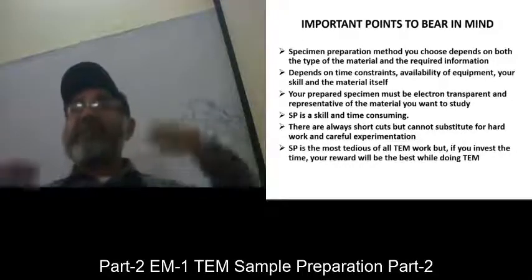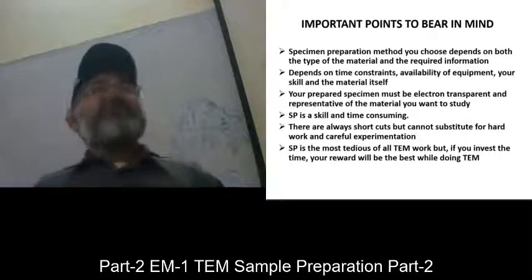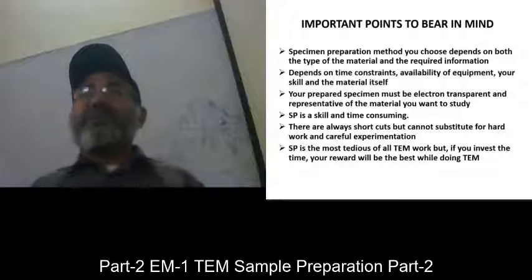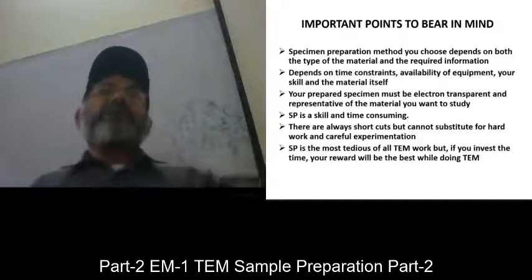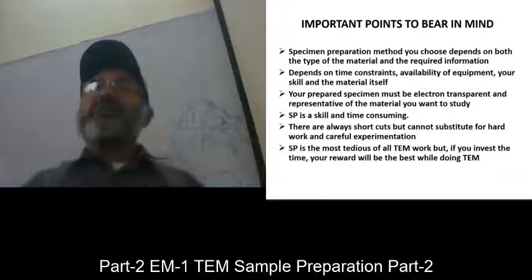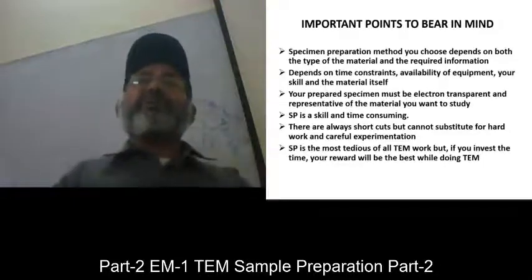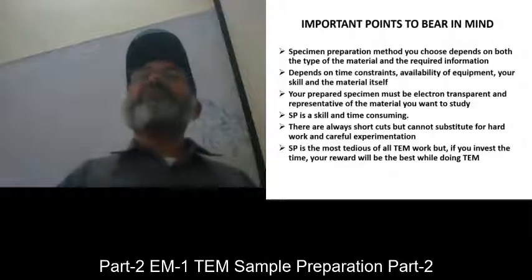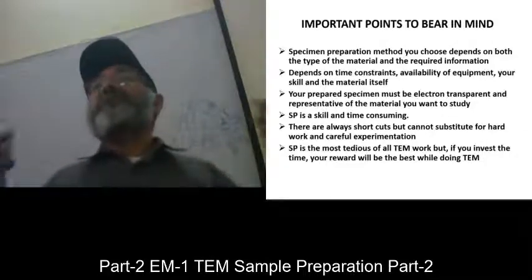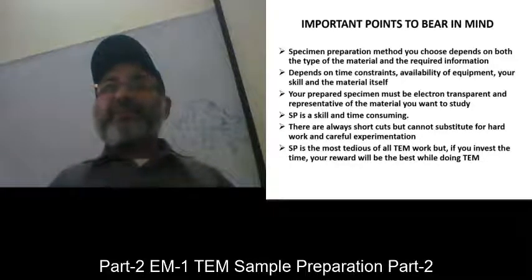Now, when smartness came, people got more experience. They have slots on the booking sheets for 2 hours. So you book 3 consecutive sessions, and you can use the machine for 6 hours. But if your sample needs 1 month, this means you are never able to prepare a sample, because you can never get a whole month in a standard lab, right?